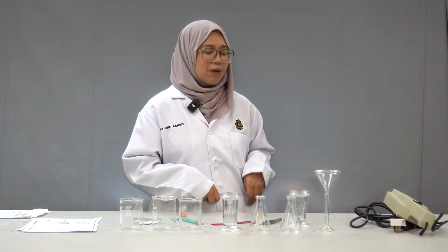Therefore, we should work in a well ventilated area and avoid open flames. Next, we should always wear proper lab attire, which is our lab coats, gloves, and closed shoes to prevent our skin from chemical splashes.